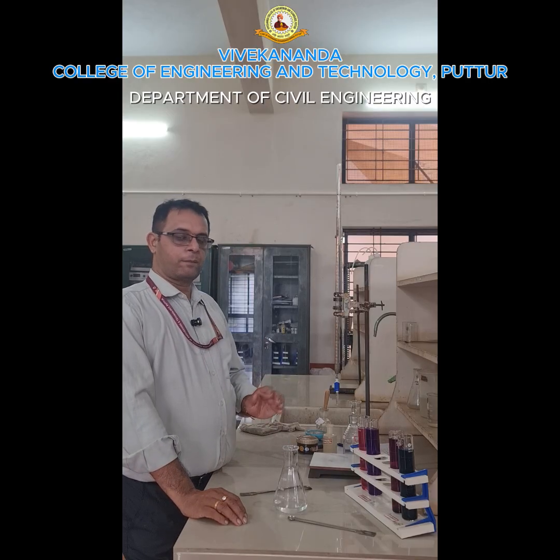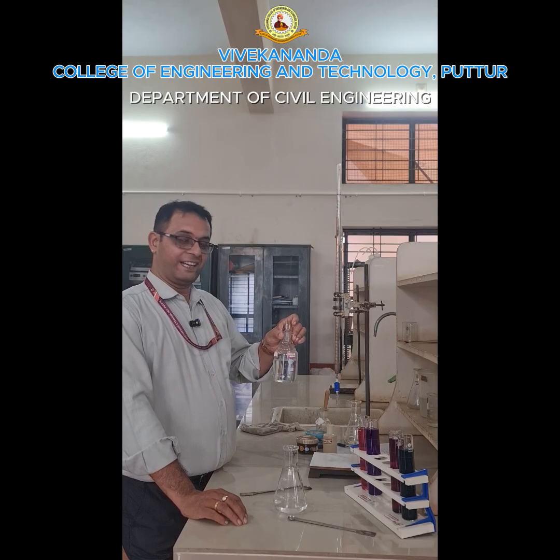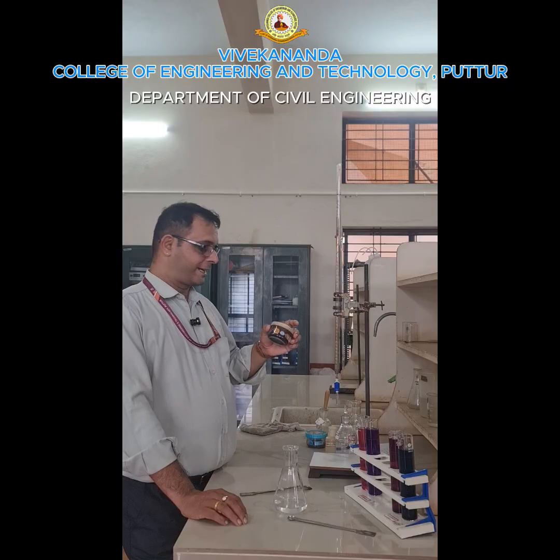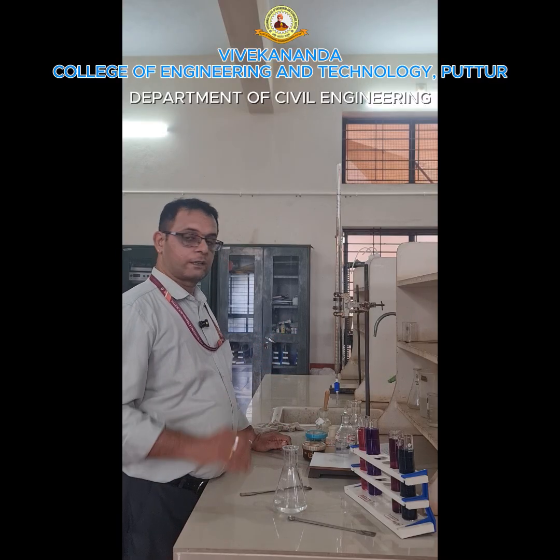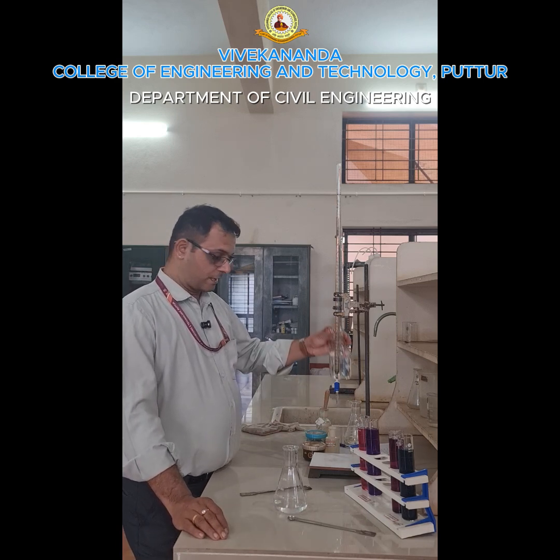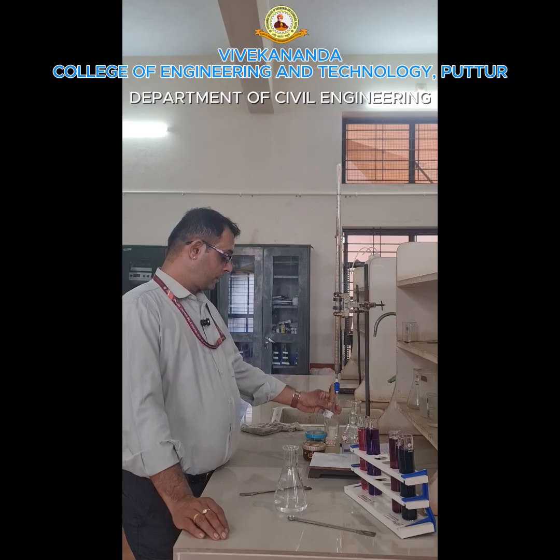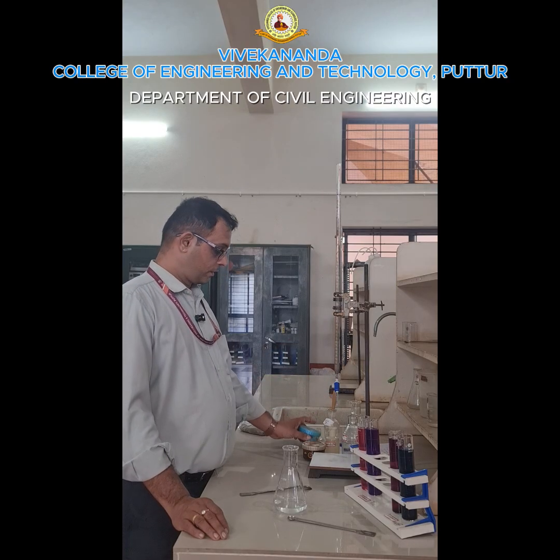For the temporary and permanent hardness, we require 0.01 molar EDTA, then ammonia buffer, Eriochrome Black T as an indicator. Then for the calcium and magnesium hardness, EDTA solution is required. Then we require 2 normal NaOH. The indicator we are going to use is Murexide.